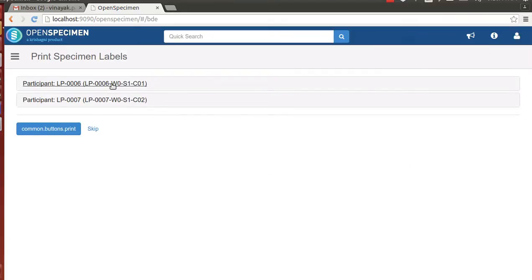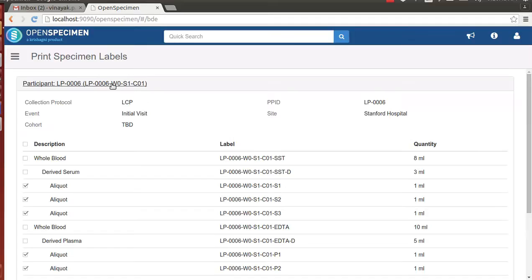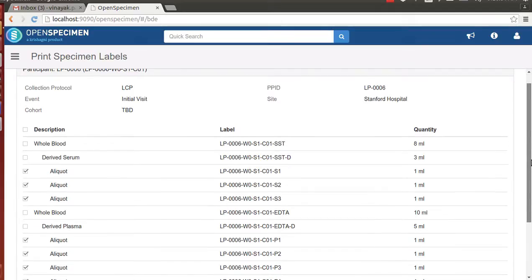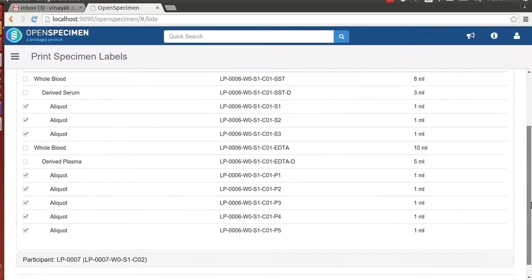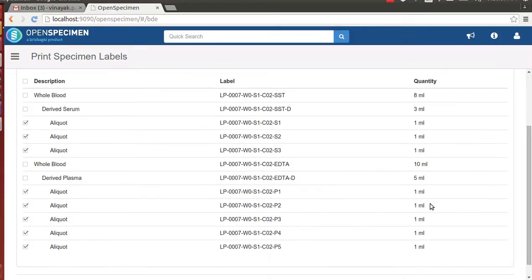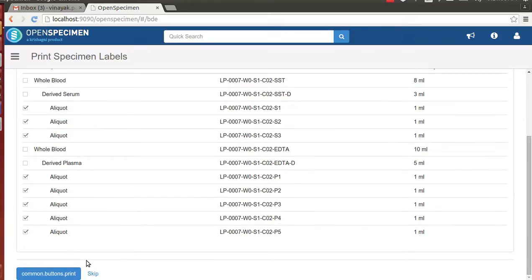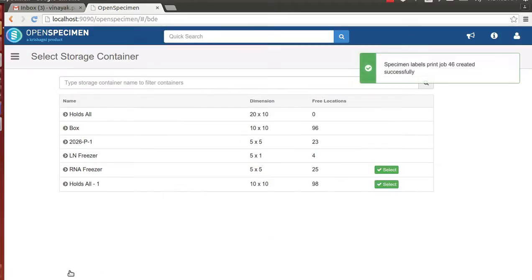Now here, the technician has an option to print the aliquot labels. By default, all aliquot labels are selected and will be queued for printing. The technician reviews this screen for each of the patient visits and submits to queue the label printing job.